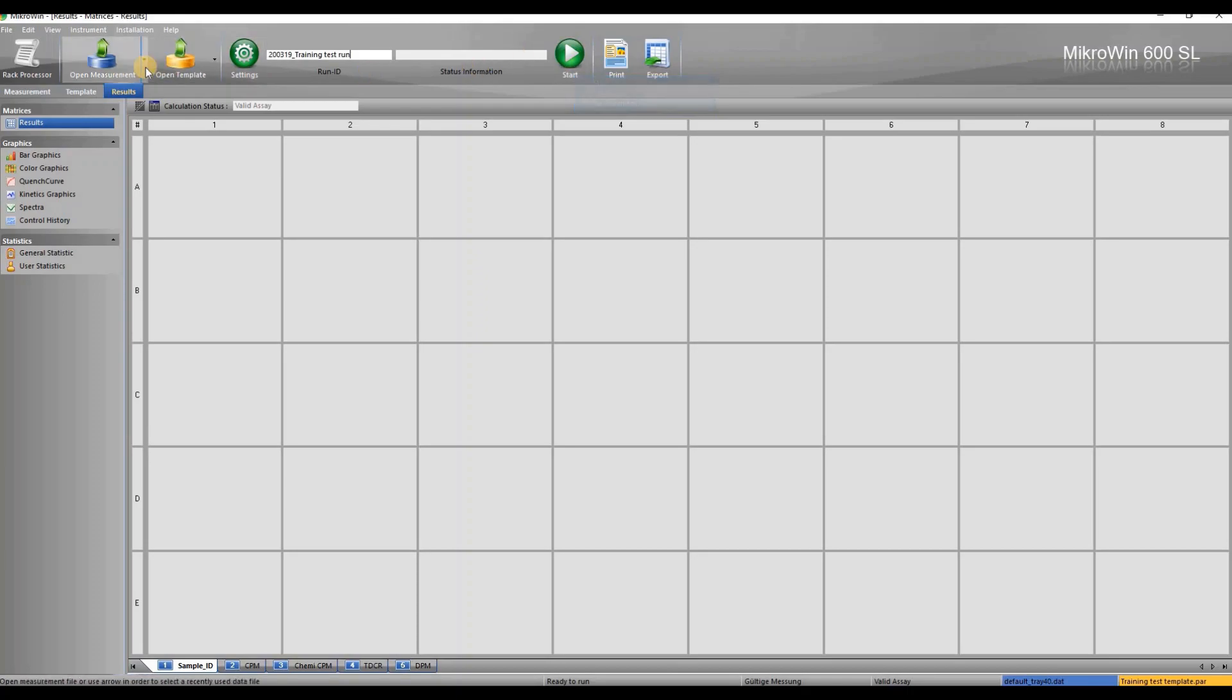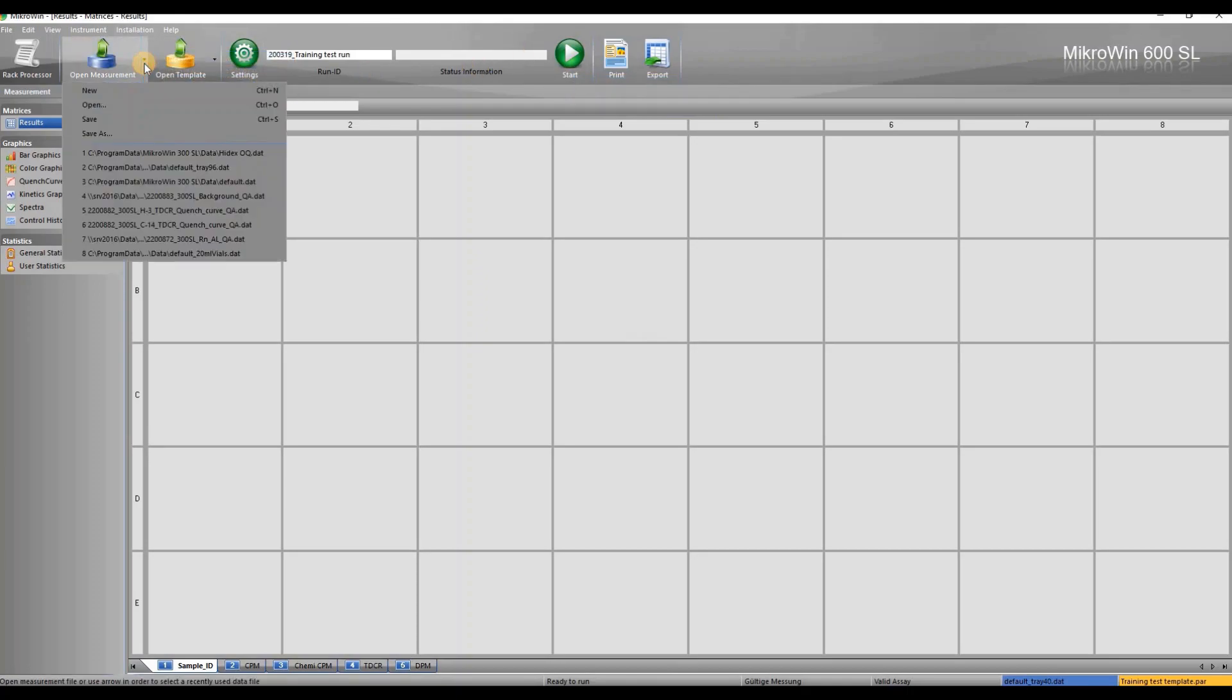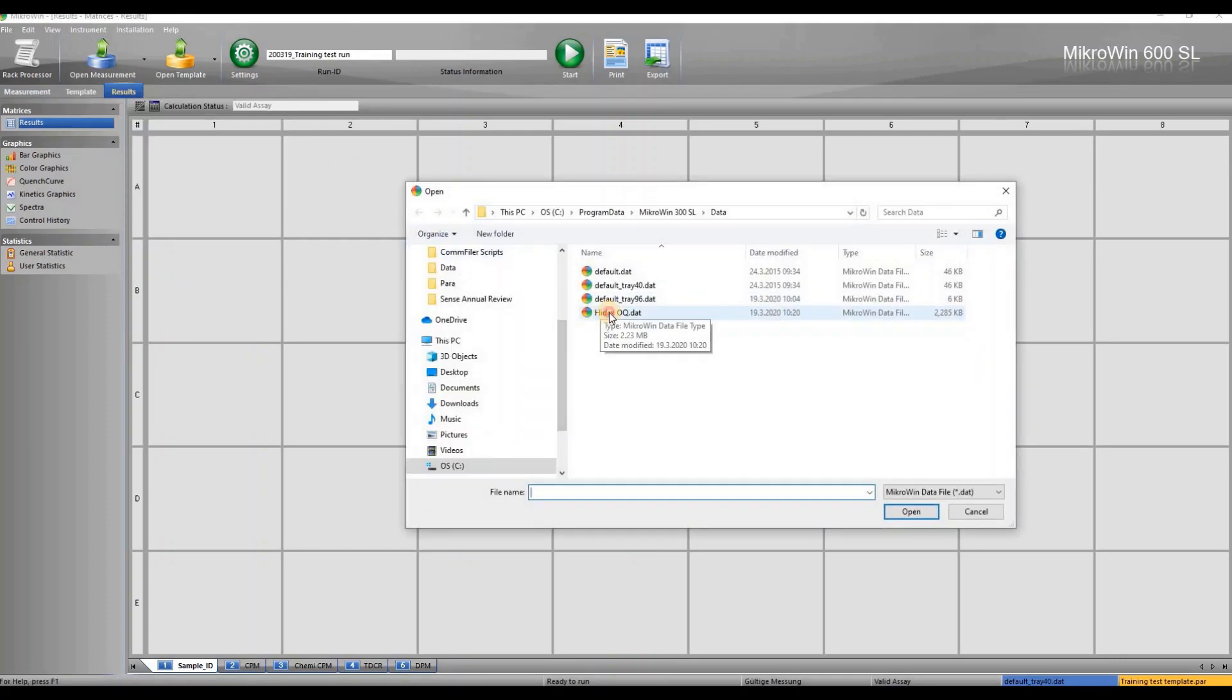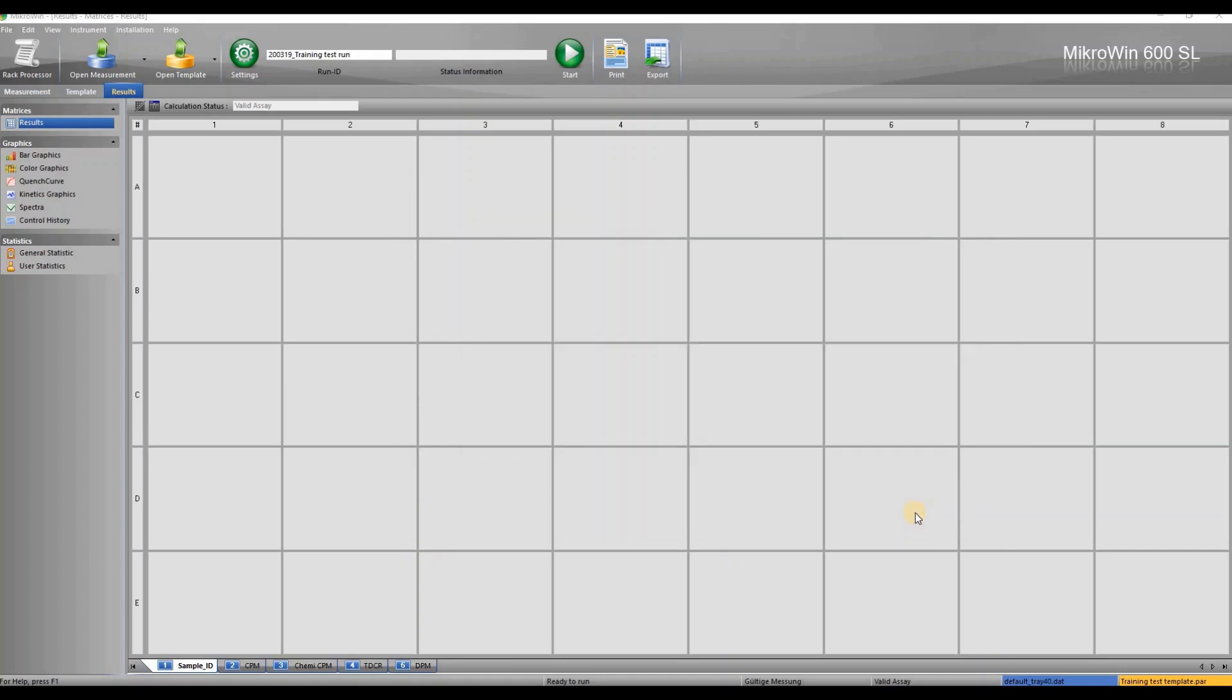We are going to open an existing data with the open measurement button. All data is automatically saved to the data folder after each run. The name of the data is stated in the bottom right corner and the template is embedded with the data.